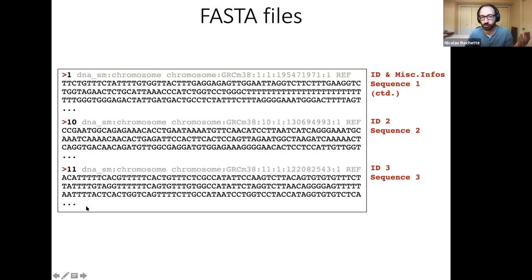And because the mouse transcripts are going to match much more closely the mouse genome, they're going to align to the mouse genes, and the human transcripts are going to align to the human genes. And then you can just filter out everything that maps to the mouse genome. You're also going to have a quantification of how much maps to the mouse genome. What this would involve in practice is taking this genome sequence file and concatenating the two genomes, so you have a genome with all of the human and all of the mouse chromosomes. Okay, all right, thank you.